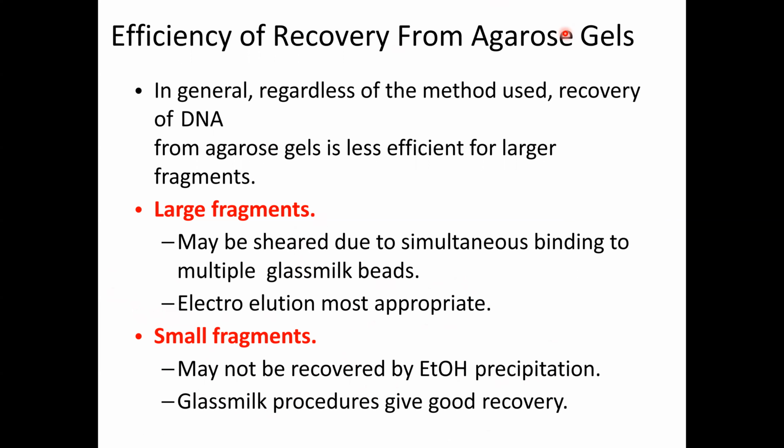Okay. So for part 4 of our discussion, we're going to discuss the analysis of gel electrophoresis. As you can see, this is widely used in our laboratory. If you're working in a laboratory, you could always check how to analyze your gel electrophoresis using this graph or this kind of result. So what is gel electrophoresis, and why do we need to use it?